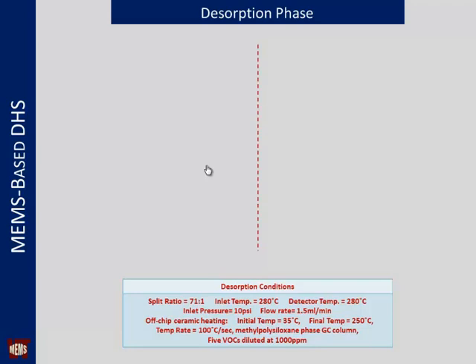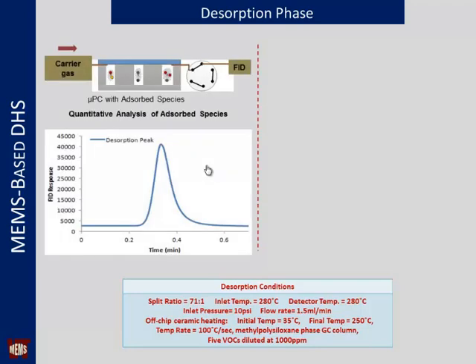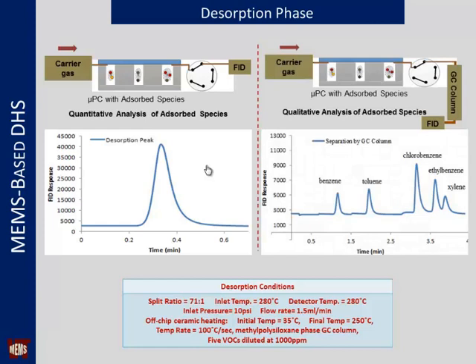First, we connected it to the flame ionization detector to just verify that we can trap them. We took the VOCs after we passed them through the first stage, and we sent them through the microtrap, or this microfabricated preconcentrator. Then we heated up this microfabricated preconcentrator, and all the released compounds went into the flame ionization detector, and we were able to see a peak. That was the first demonstration that we have been able to capture the compounds, extract them from water, and then capture them on the preconcentrator.